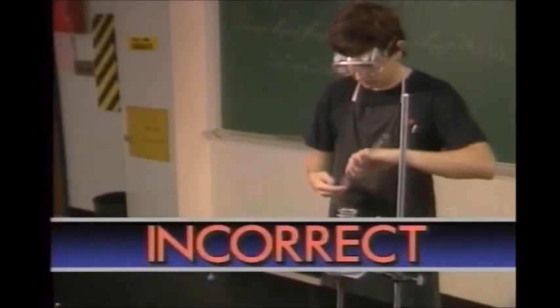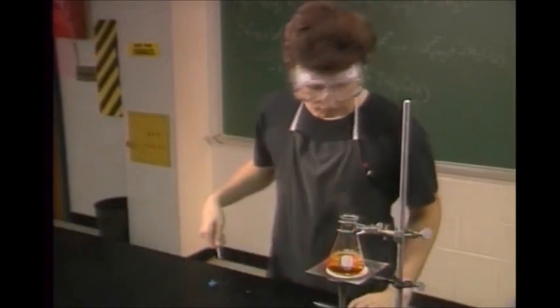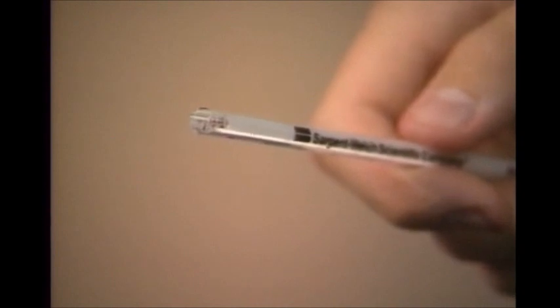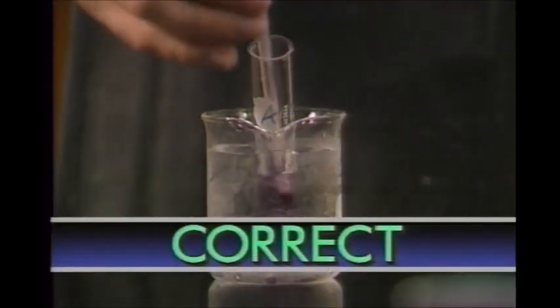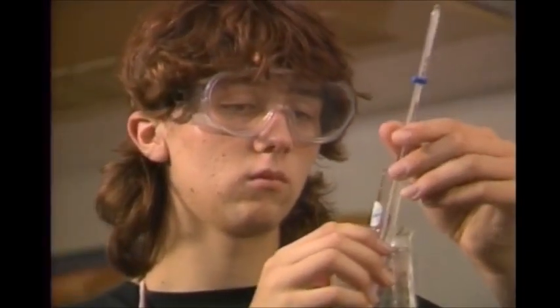One common misconception is that lab thermometers have to be shaken down like medical thermometers. Shaking is totally unnecessary, and it can be dangerous. The liquid inside can move freely up and down on its own without shaking.